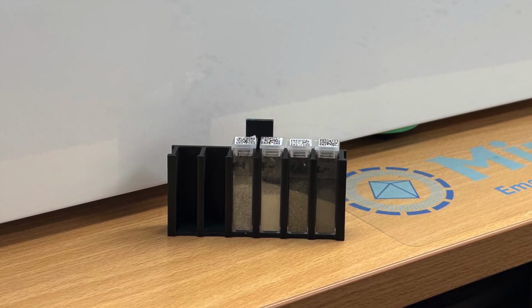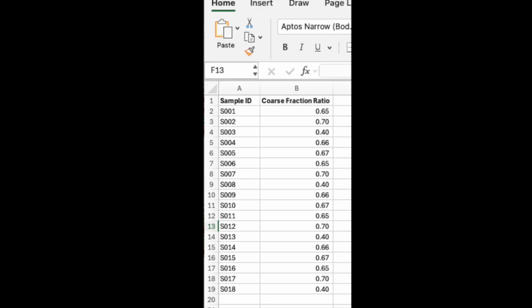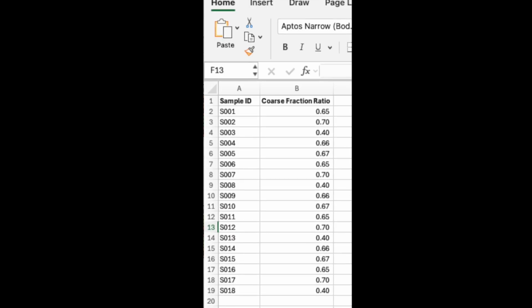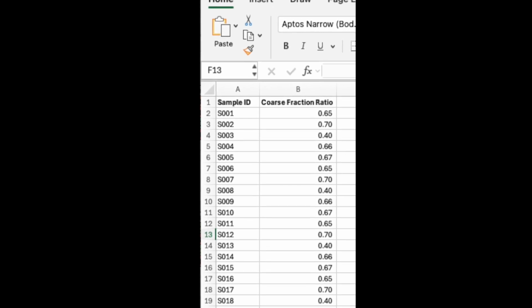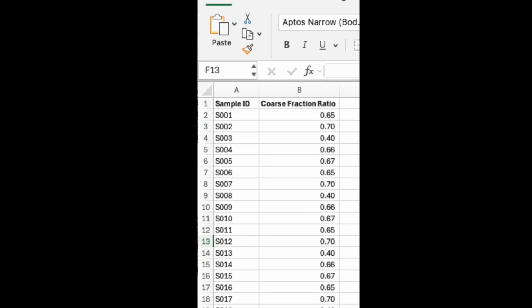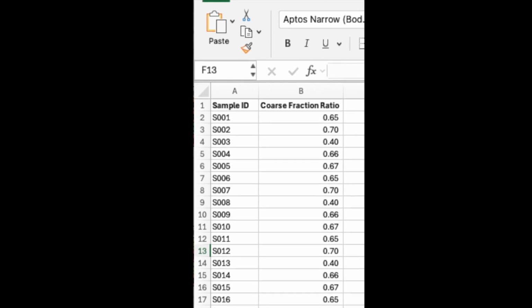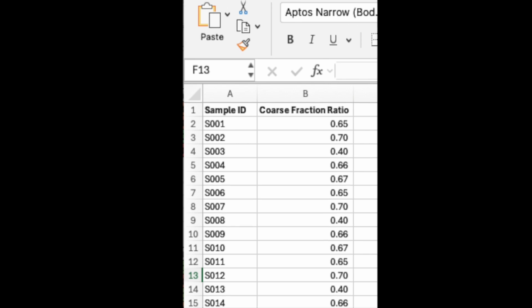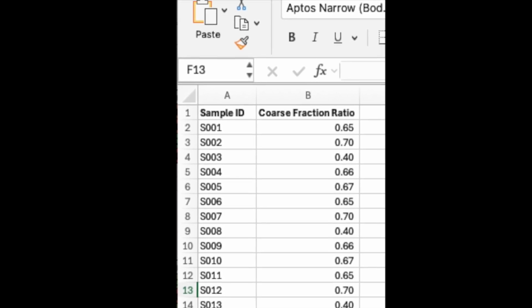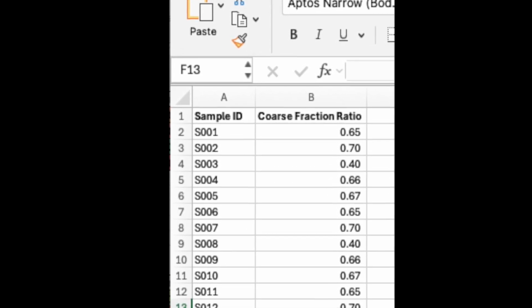a rougher con product. The only information that the Emago laboratory device needs in order to start sample registration is the list of sample pairs to be analysed. The ratio of the coarse to the fine fraction must be recorded against the sample pair. So simply create an Excel file with this data and load it onto the Emago.